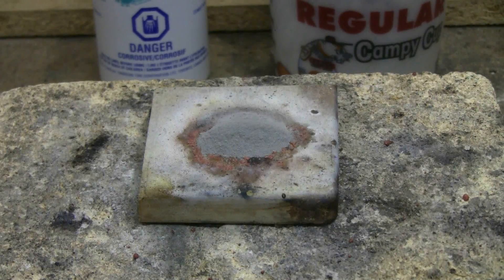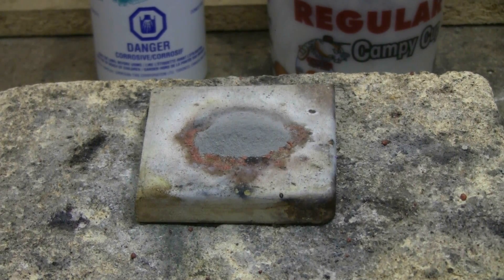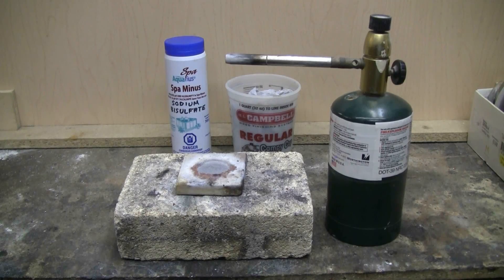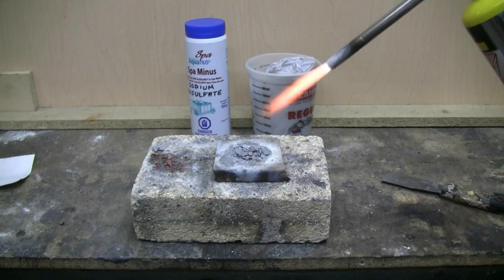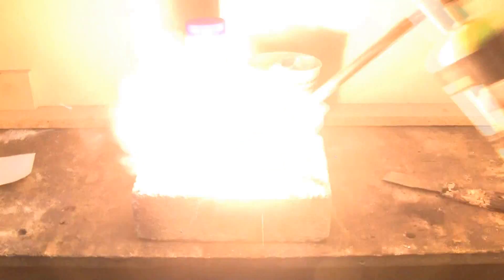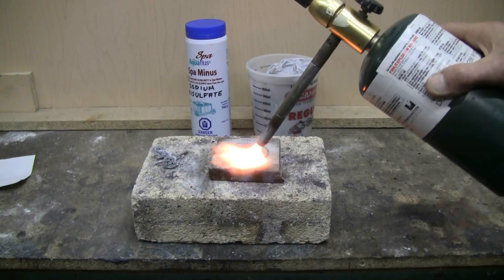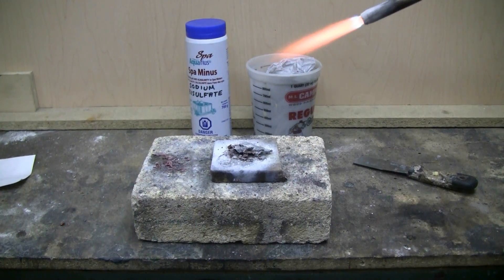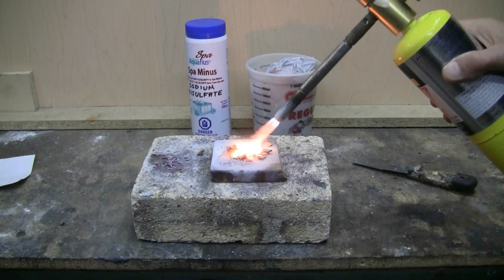This stuff is very hard to light. I'll be using a torch, and it'll probably take a little while to get it to go. You pretty much have to melt it in order for the reaction to start. I'll be using the propane torch shown here as the heat source required to start this reaction. Ready to start this reaction.